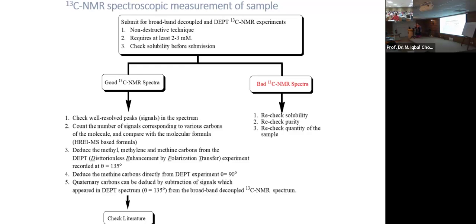So you can think of one doublet with one peak here and the other peak there, and then another carbon with another peak here and the other there. If I look at this spectrum, I will be confused. Are these two peaks the partners, or these two? How will we identify that? And it is important, because we want to identify CH, CH2, and CH3.